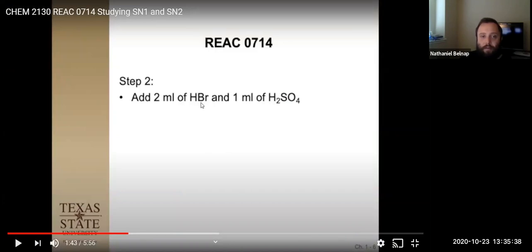So you're going to add 2 mils of hydrobromic acid and 1 mil of sulfuric acid.